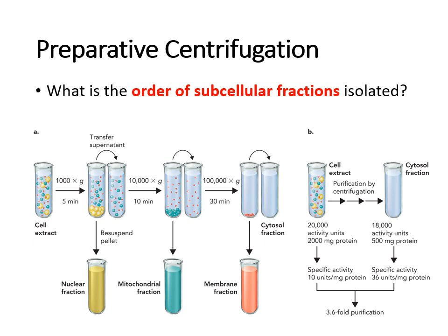Now, I had mentioned a centrifuge and centrifugation. I just want to show you the order of subcellular fractions when you are using a centrifuge to concentrate and purify out certain fractions from that cell extract. Sorry, let me get the laser pointer.